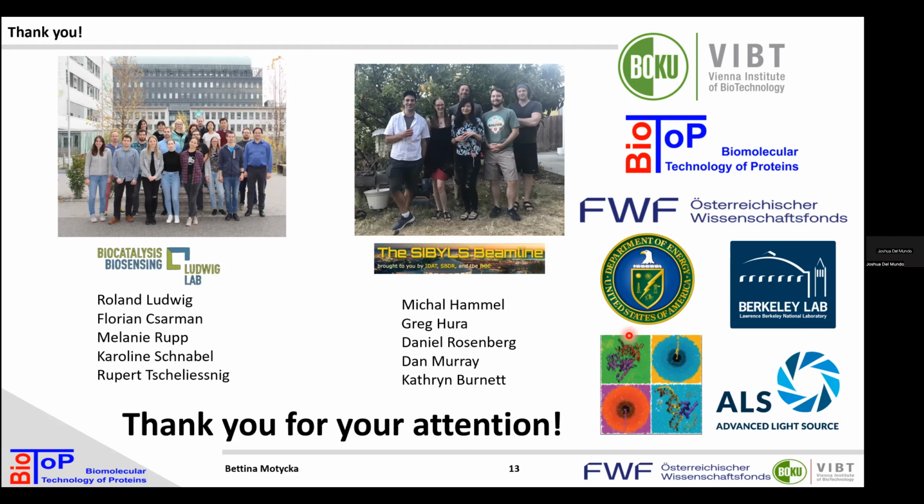Real quick, sorry, that was a really nice talk. Thank you. I was wondering if you had any difficulties preparing your models for BilboMD so that they had the cofactors and glycosyl groups present.